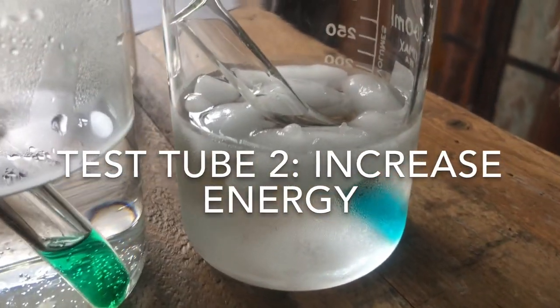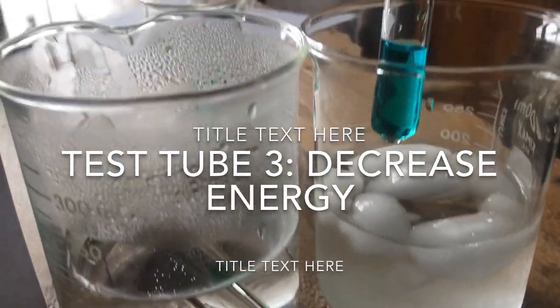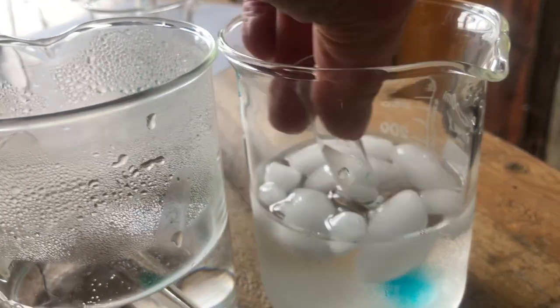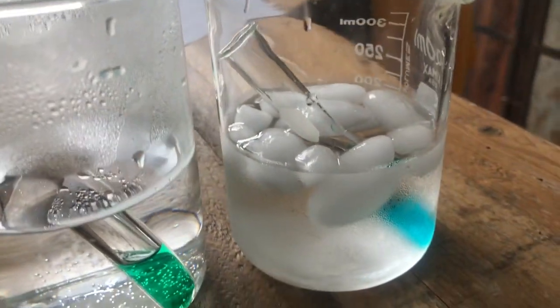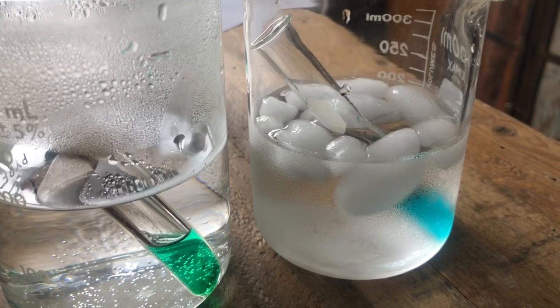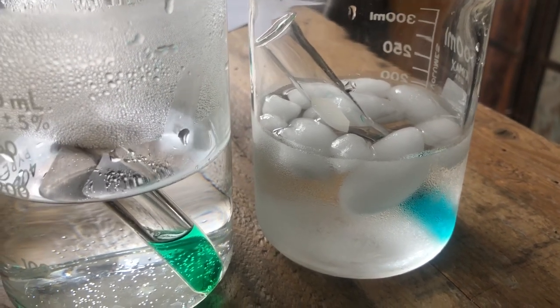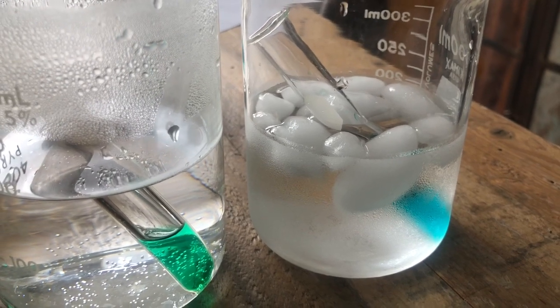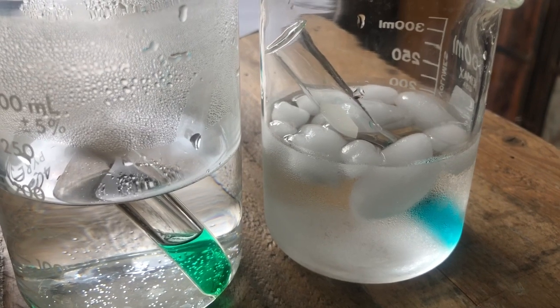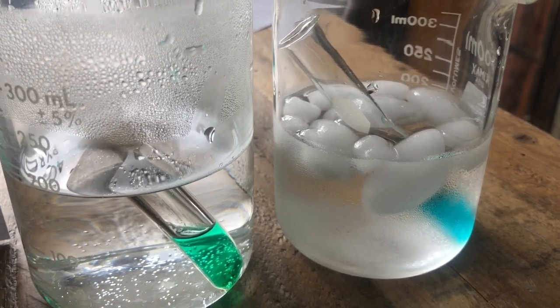For the ice water bath for test tube 3 there, you can see that it is turning blue over time. What we're doing here is we're decreasing energy, and when we decrease the energy of the system, it's going to pull the reaction towards where energy is located, which is on the right. So it pulls the reaction towards the right side, which is why the solution is turning blue. Blue is a signal of it being on the right side of the reaction.